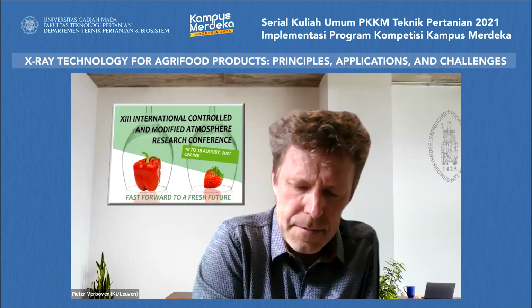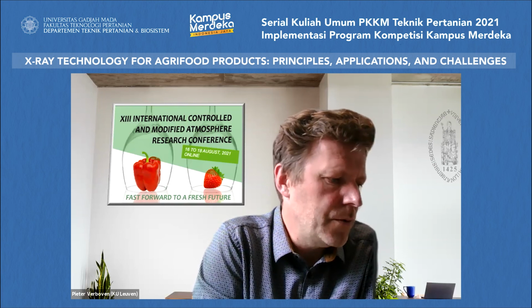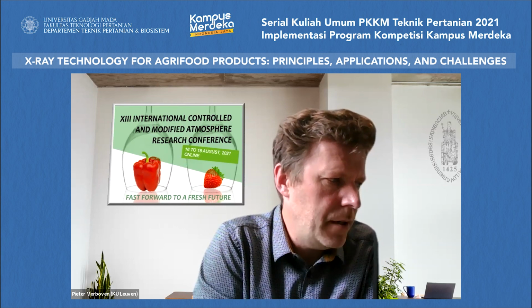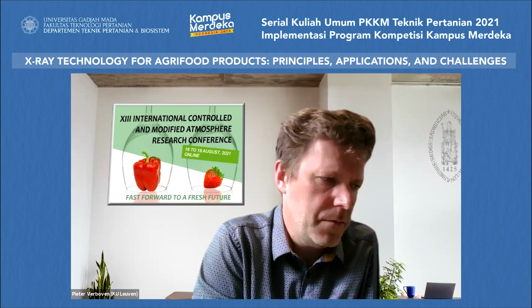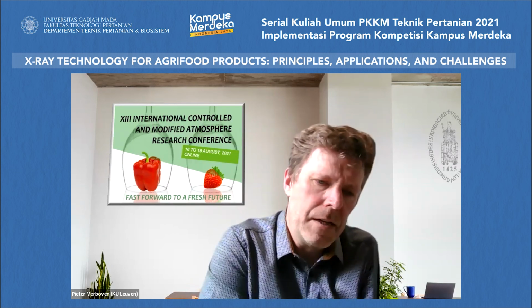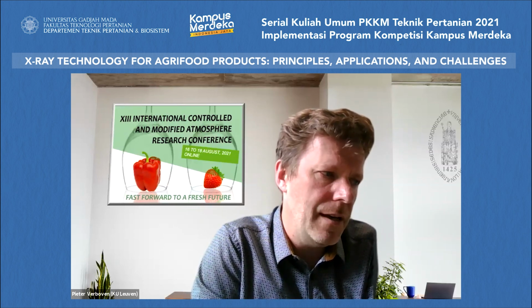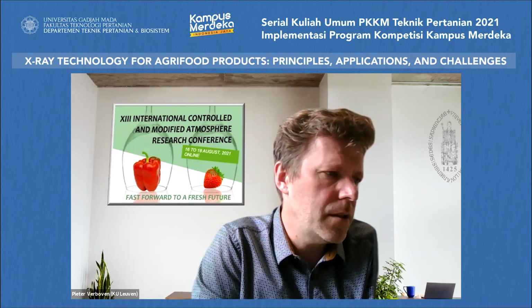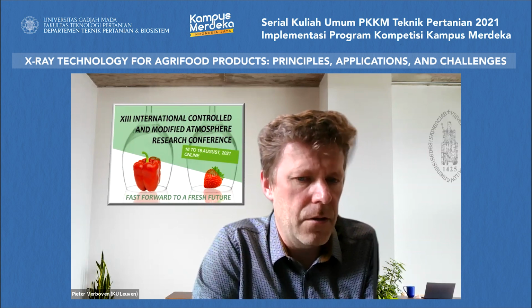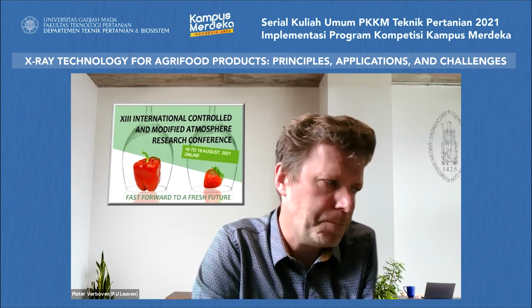It's the last topic in my presentation. I touched upon it. So for doing really high resolution three-dimensional imaging, it used to take hours. Ten years ago, it took hours. Today, it takes 5 minutes in the instruments that we have in the lab. So you see there's progress being made in how fast you can do the imaging. Of course, you need to do the reconstruction, you're correct, and you need to do the image processing.